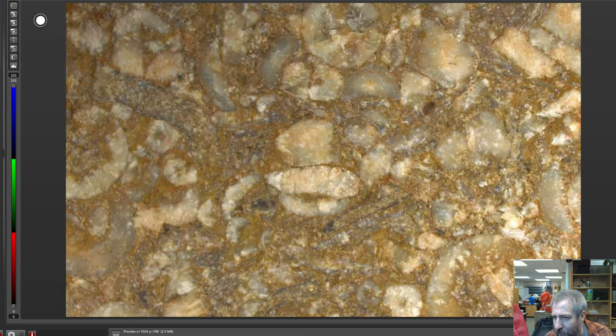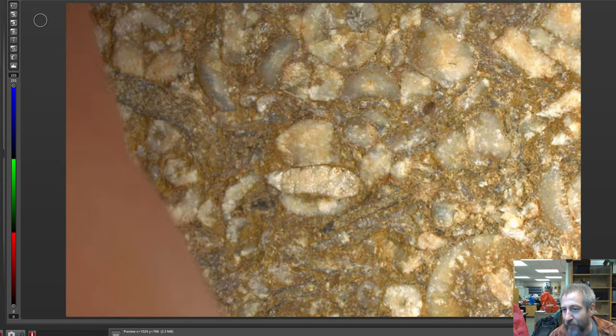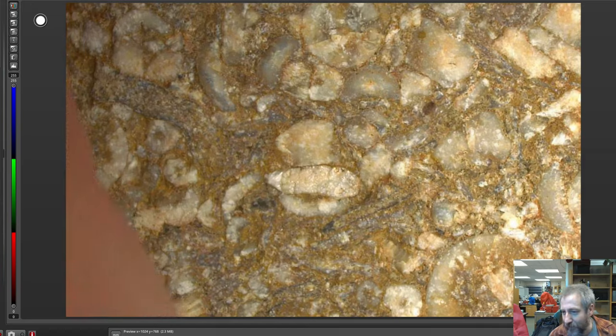Let's see. You can decorate it. What can I decorate? I'm confused. Hey, Mama Bonbon, how's it going? The positive stop is behind the focus knobs, so you gotta take it apart. Oh, yeah, that's probably better to have a professional do that, Volcano Doc. Hopefully they can get it and get it back to you pretty easily.